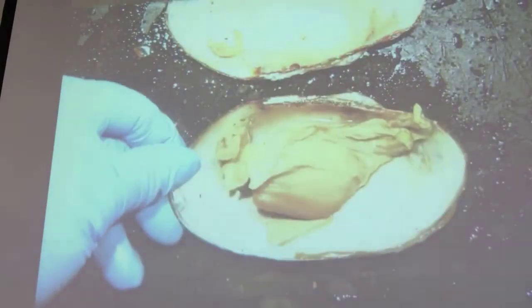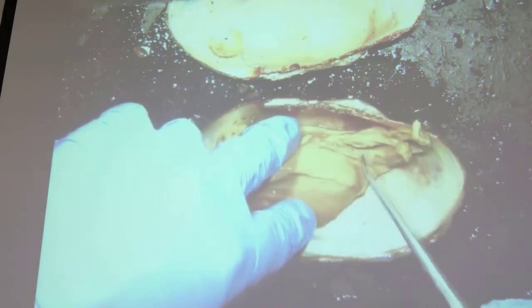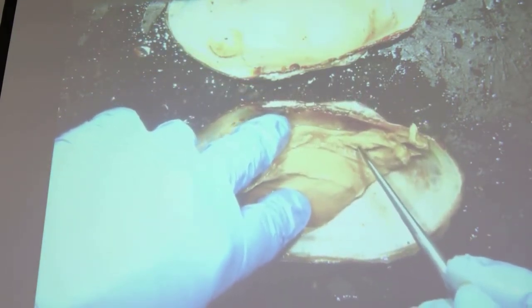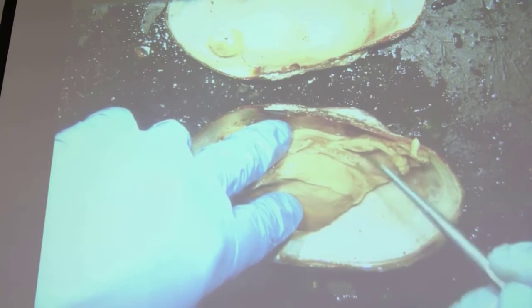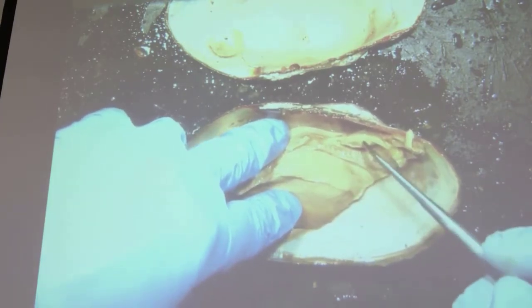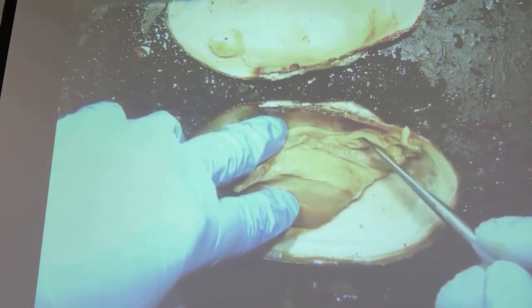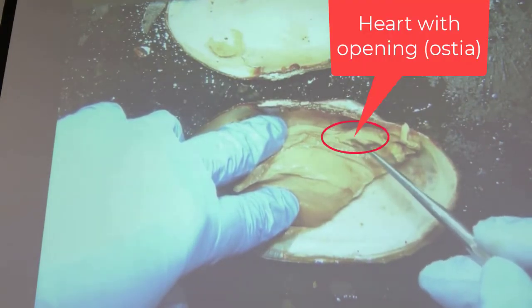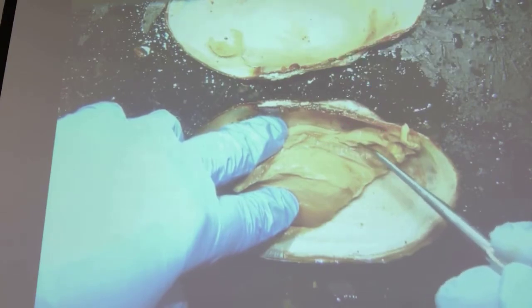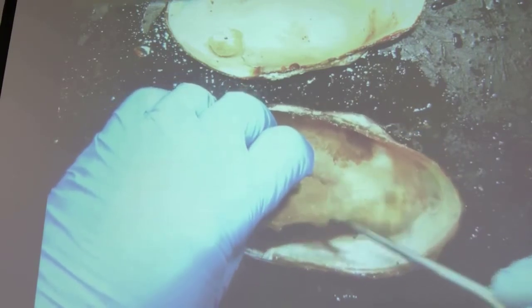As we look at more of the characteristics of the clam, most mollusks, except for the cephalopods, have an open circulatory system. The cephalopods, which include the chambered nautilus, cuttlefish, squid, and octopus, have a closed circulatory system. But here in this bivalve, they have an open circulatory system, and this is the heart. This is an opening of the heart called ostia, the way that blood is going to enter back into the heart. And we might be able to see, it's covered by tissue.